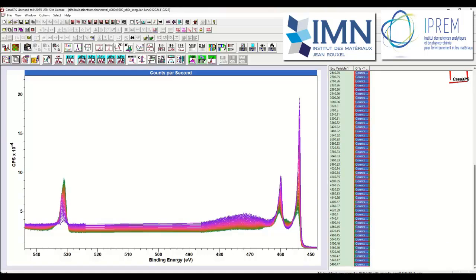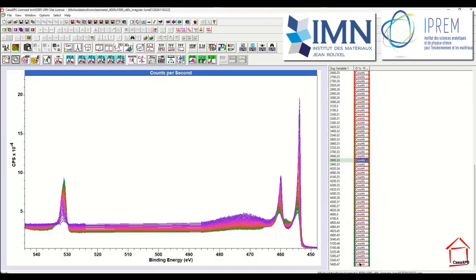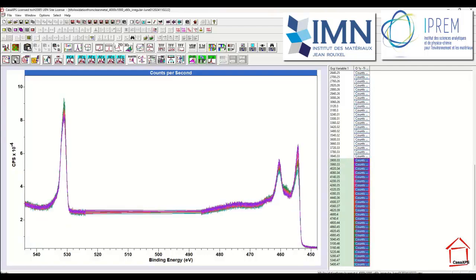And I might guess that the end of this experiment, where the oxide has formed to a greater extent, might be representative of spectral shapes that actually sit in a 2-dimensional space. And we can test that hypothesis by applying the PCA calculation to a subset of these data.